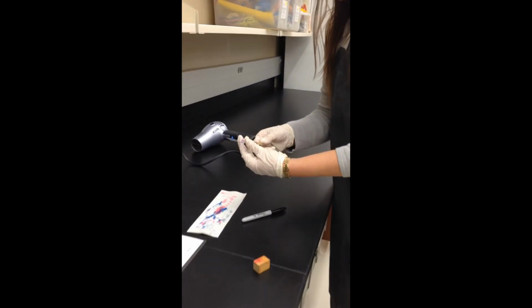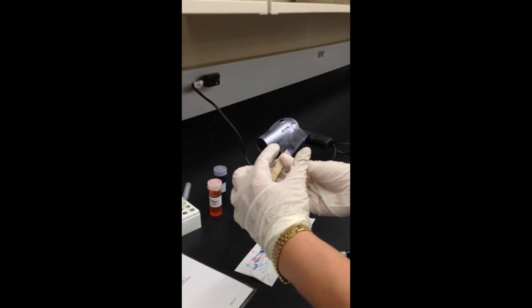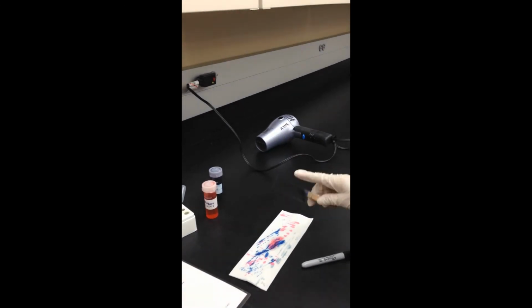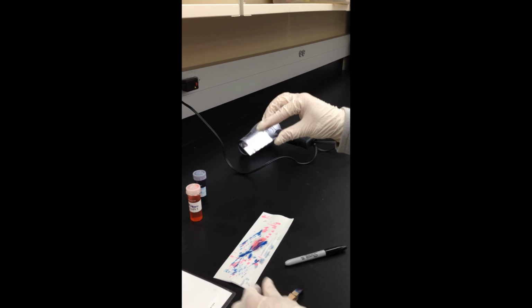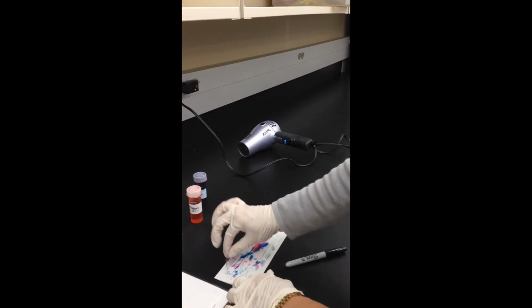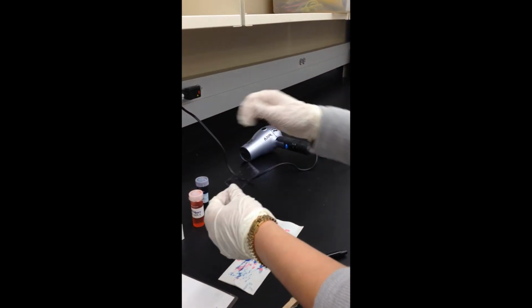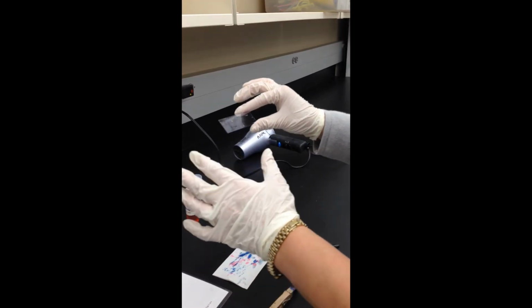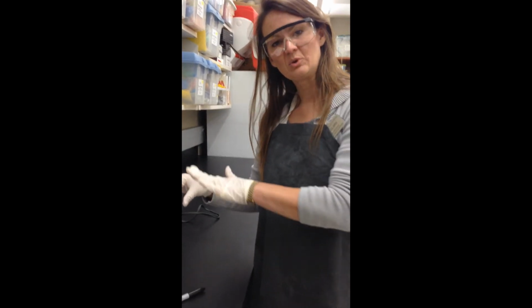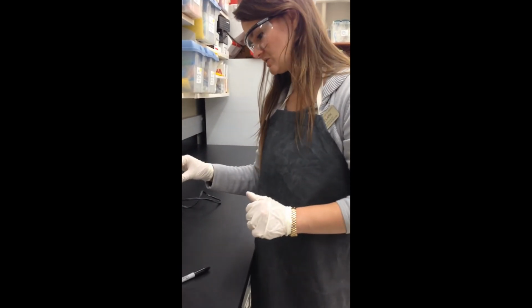Once you get your slide dry, notice we can still see top written here. That will be the side that you will place on your microscope to view your slide. Once you have washed everything away, if you wouldn't have had this written here, it would have been really hard to remember which side you need to put up on your microscope. So don't forget to do that.